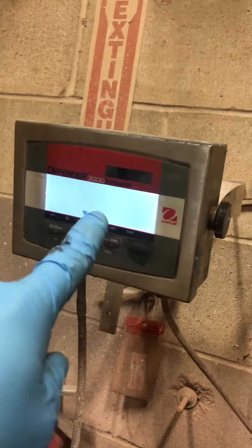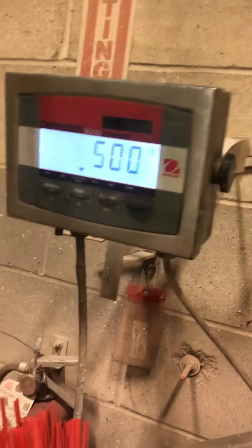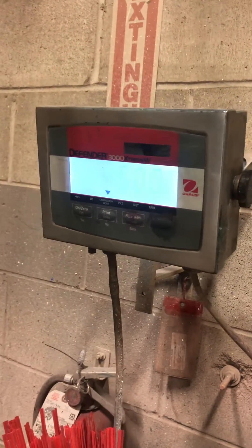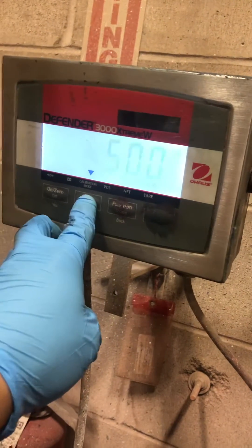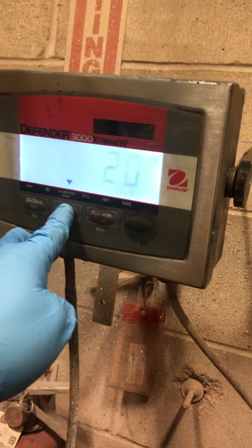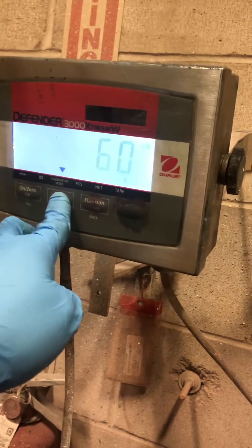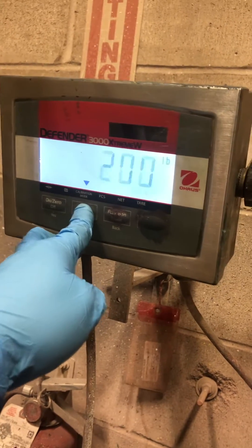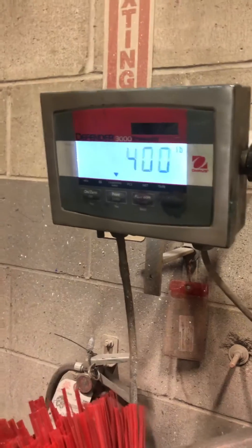That's the last weight amount that was used to adjust the calibration of this scale. You want to change it, you hit no, and the no changes the amount until you get the amount of weight that you want to apply. Leave it like that, and you apply your weight.